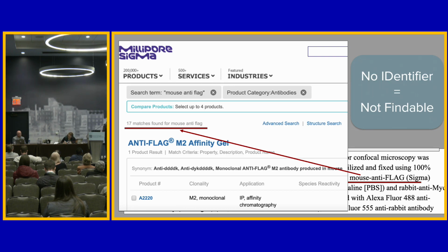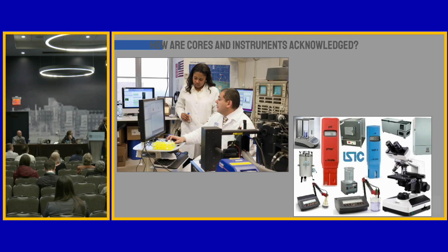And when you come back to Sigma the next year, I did this talk once with a single antibody for about 4 years. And every time I would actually do that search in Sigma to see how many antibodies there were, and it went up and down. But which ones were there when the person ordered it before? So that is what happened.